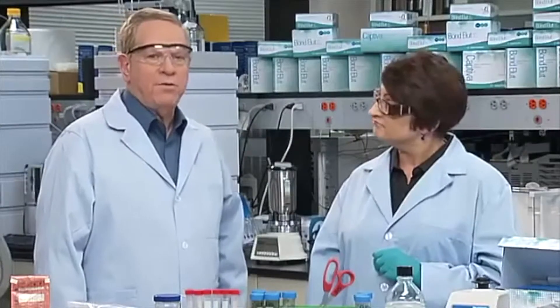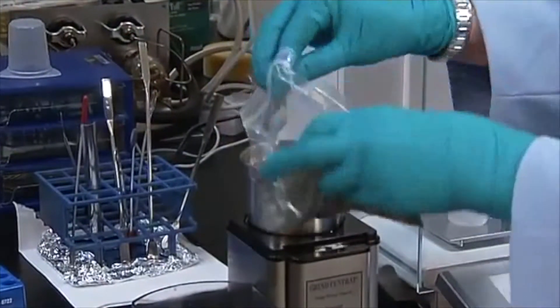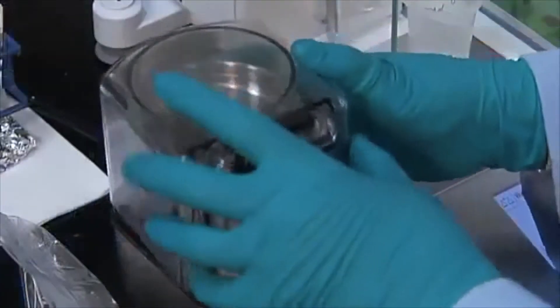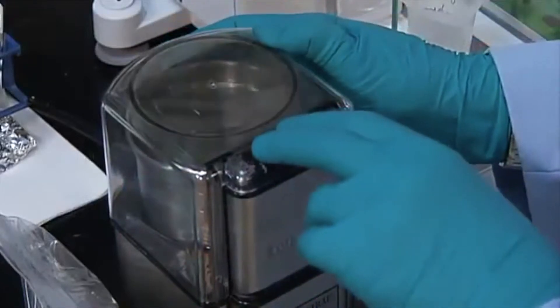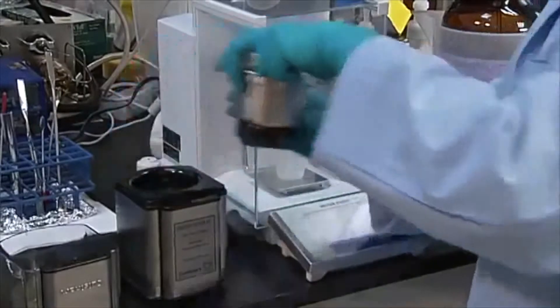Let's take a walk through the QuEChERS technique in order to get a better understanding of what's involved. The first step of this method, acetonitrile salting out, also known as partitioning or extraction, requires the homogenization, or grinding, of a solid sample. We will accomplish this by chopping and then grinding the sample. For the best extraction efficiency, the sample should be in a finely divided state.